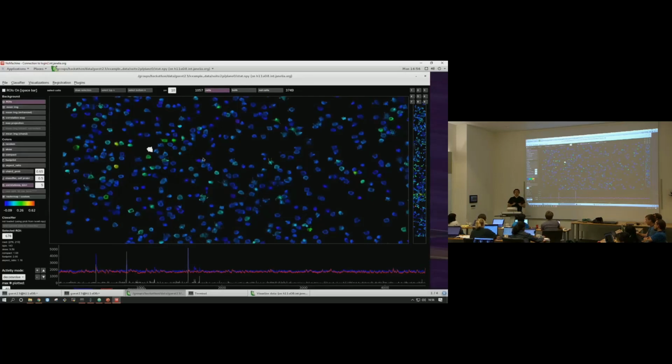And it barely degrades the performance. So as long as you're within a factor of 2 or 3 of the true time scale of your indicator, the answers shouldn't change too much. It's pretty robust to that. That said, if you do have some a priori reason to think this cell class should have a different time scale, so I'm going to modify the parameter in C2P and use that time scale, I think that will be absolutely fine.